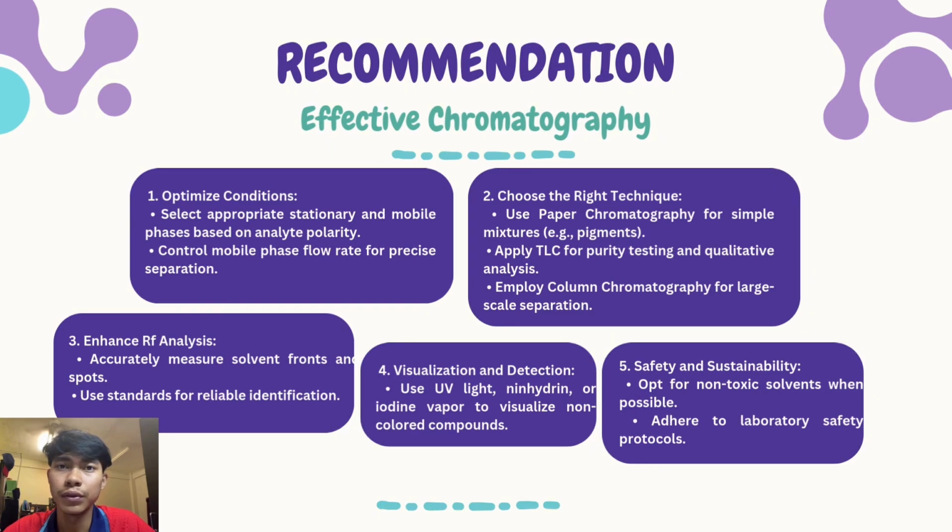Fourth is visualization and detection. For non-colored compounds, visualization can be improved using UV light, ninhydrin, or iodine vapor. Fifth is safety and sustainability. Finally, prioritize non-toxic solvents whenever possible and adhere to laboratory safety protocols. By implementing these steps, chromatography processes can be significantly enhanced.